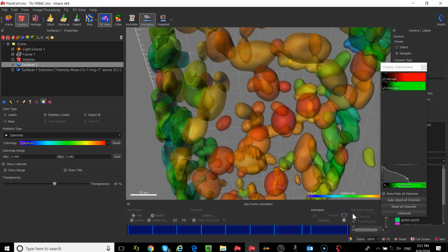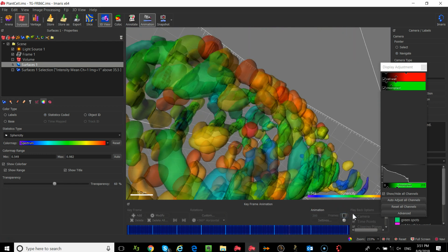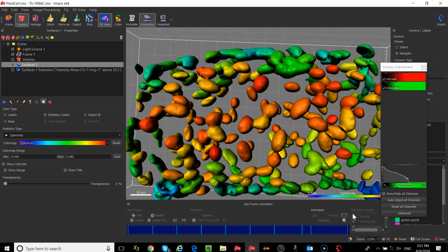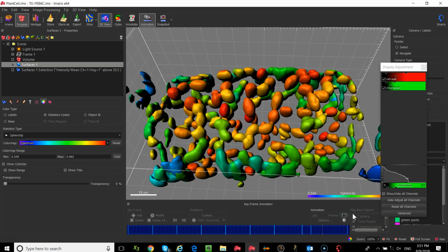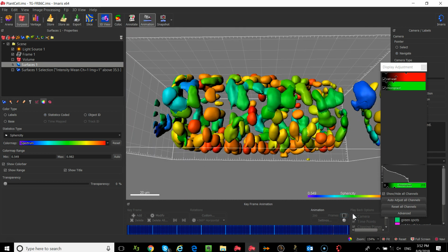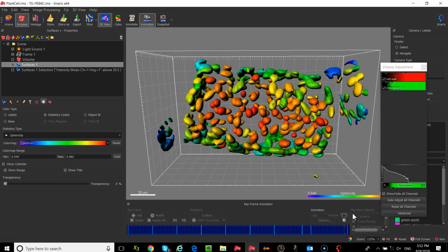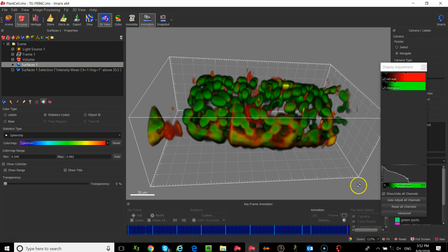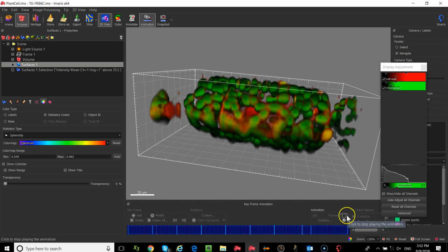So if I click play, here we're going slowly, it's going to hit the keyframe, and then that last transition will happen a little faster. I chose one that didn't really do much, but okay. So you can move them closer and further apart based on what it is you're trying to present. So all of that is being remembered.